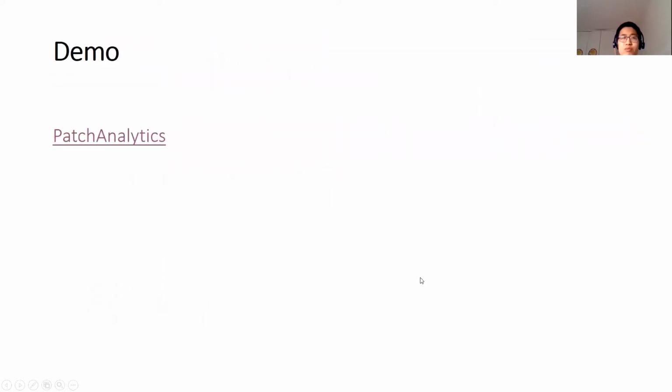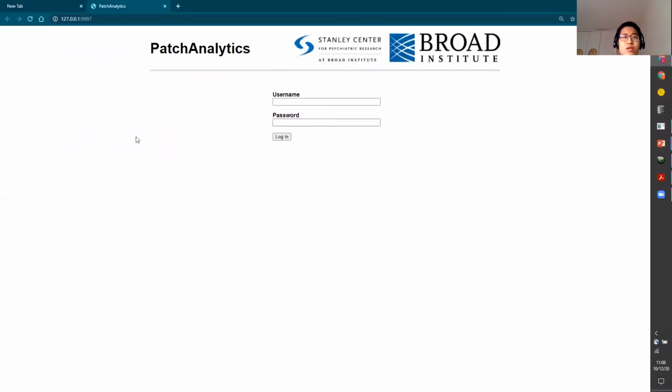So after the brief background introduction about these two projects, I'm gonna give a demo of the PatchAnalytics software we have developed. So this is a cloud-based software. It runs on a virtual machine we hosted on Google Cloud. But for the demo purpose, I'm running a local version because the local version is the most updated version. So I'm gonna log in with my password.